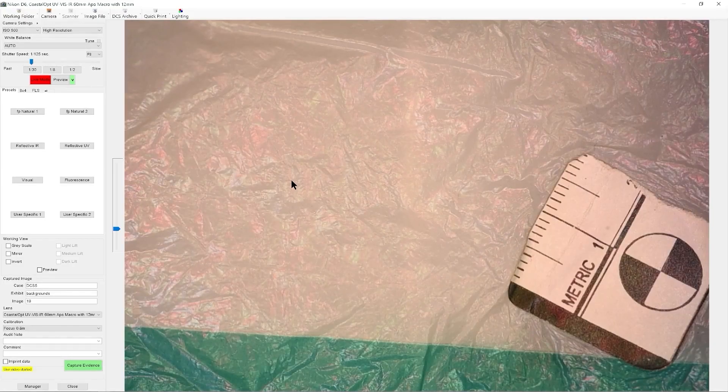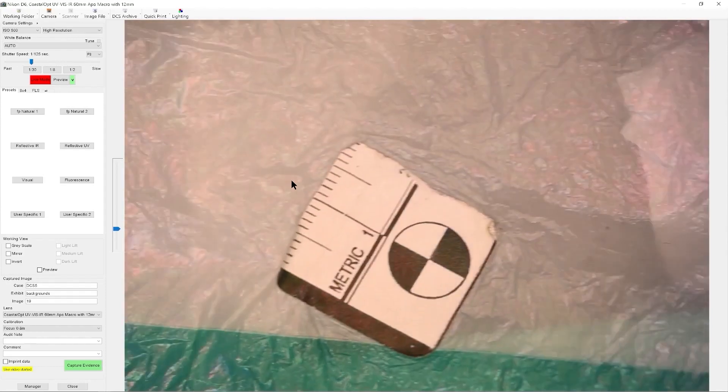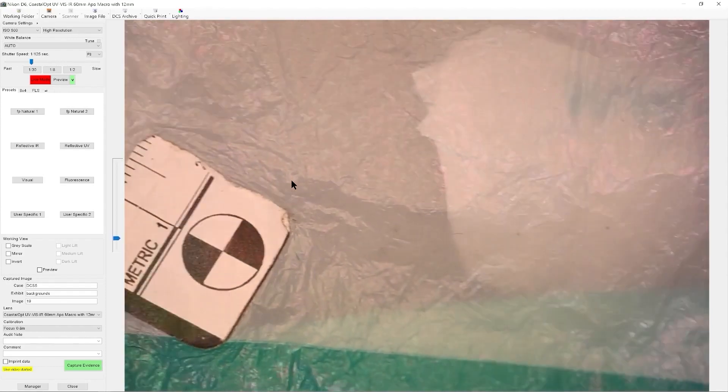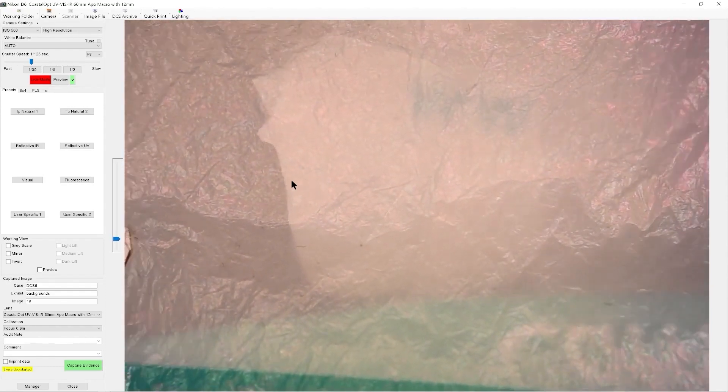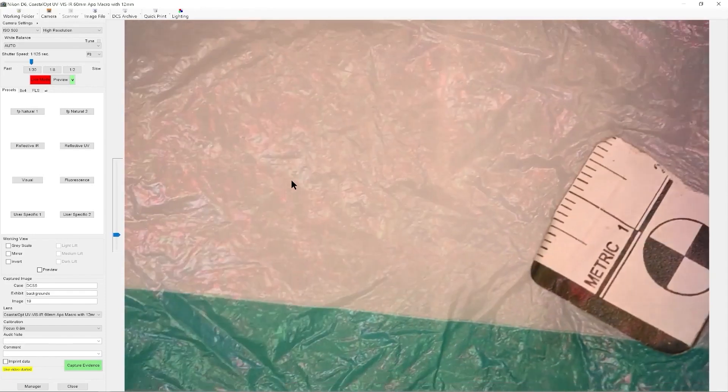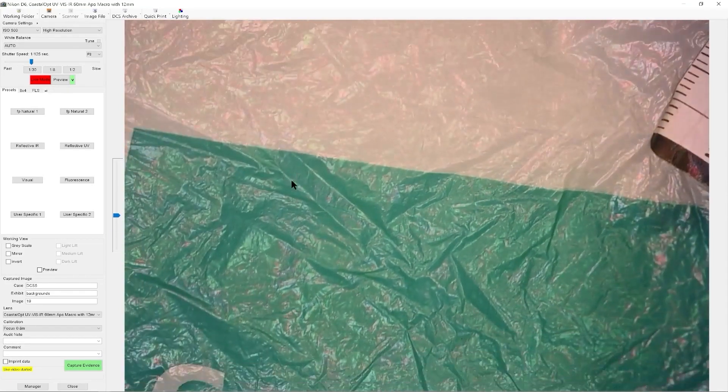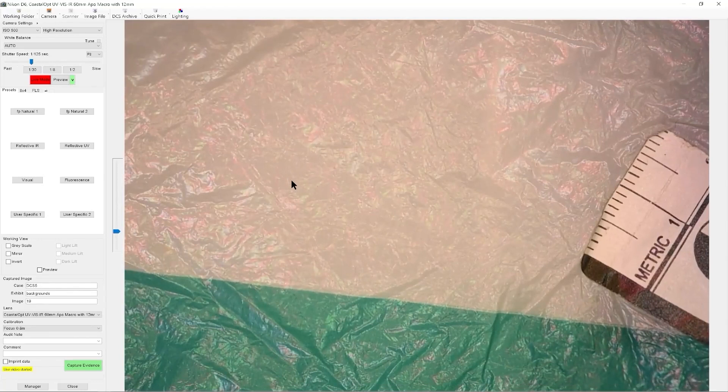So if we look under white light here on the screen, we are looking live at the moment. We can see that under normal white light, we really don't see anything at all.